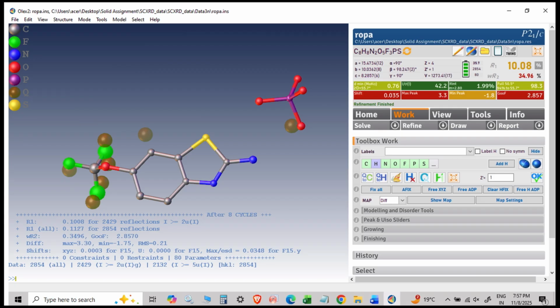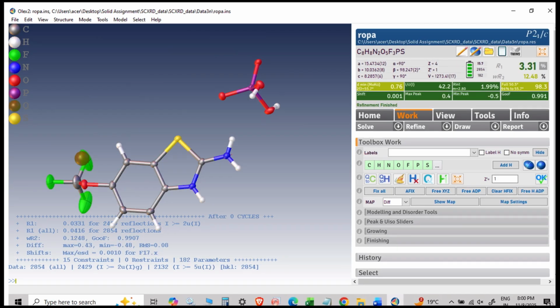This is what the main question was. At the end, I found that it is H2PO4 negative, and this particular group has to be NH3. There has to be one more hydrogen. So the software actually confuses between NH2 and NH3 positive, because for the charge neutralization we have to neutralize the charge. There is a hydrogen that exists here as well, so that it can form hydrogen bonding with this moiety. And there could be ionic bonds as well. It could be any compound as well.